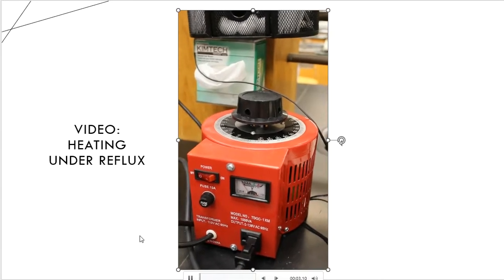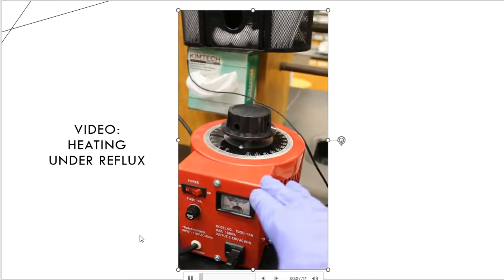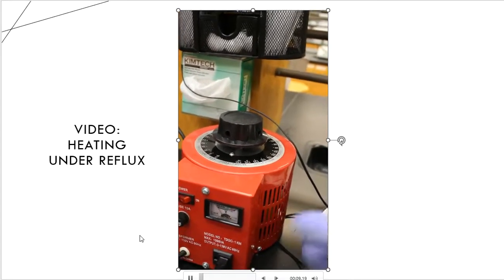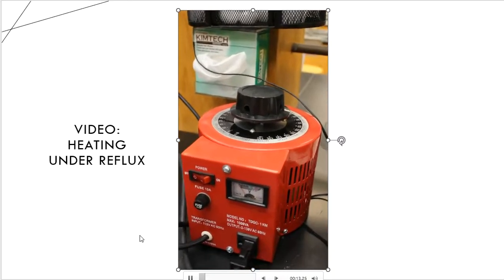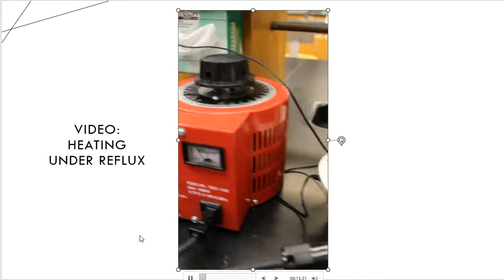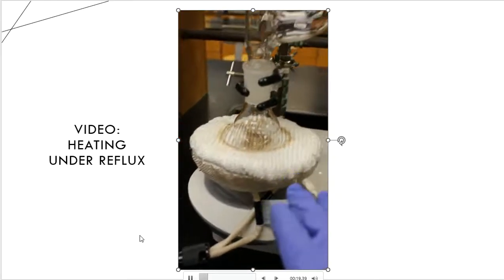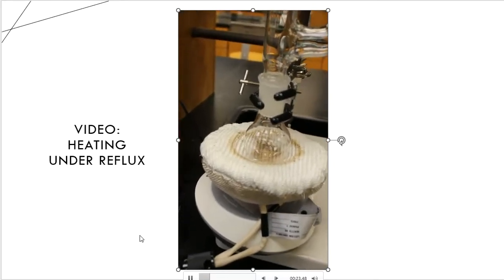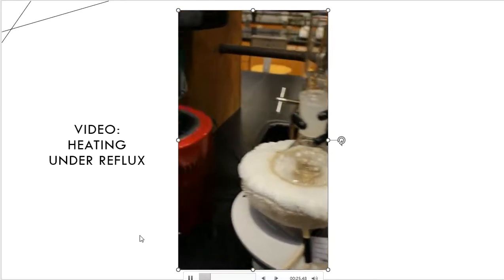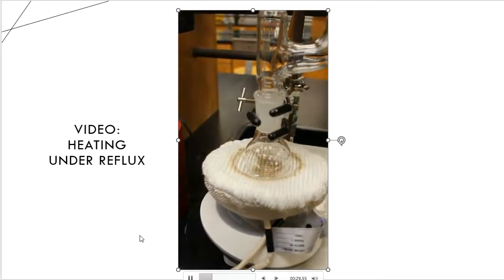All right, so heating under reflux, what does it include? It includes a variac, which is going to control, it's kind of like a stove eye. It controls how much heat that I'm going to put into the frying pan. So there's the variac, and then that variac is connected to what we call a heating mantle. This is the heating mantle that's going to basically have the heat that's needed for this reaction to take place. And of course, the variac controls how hot that actually gets.